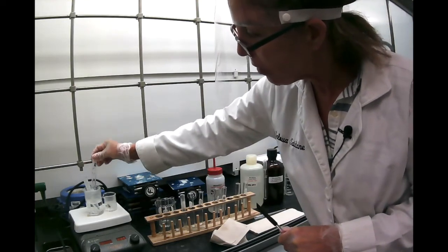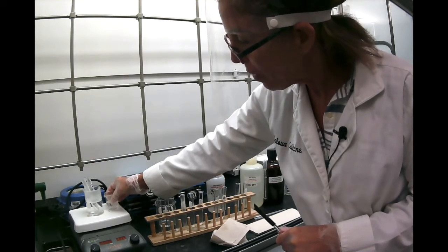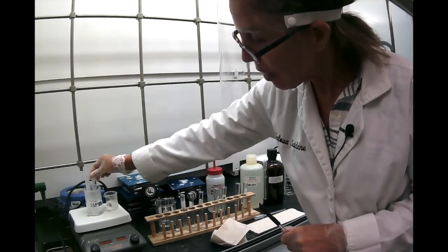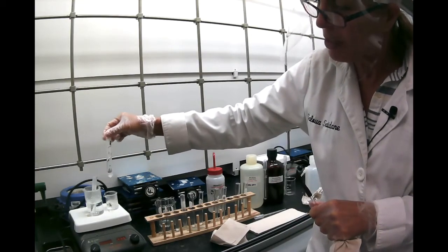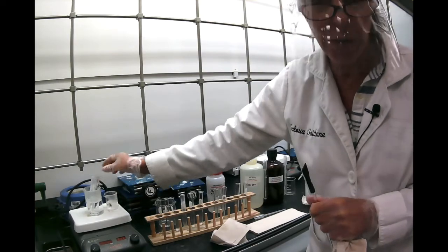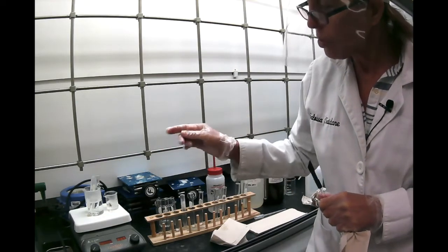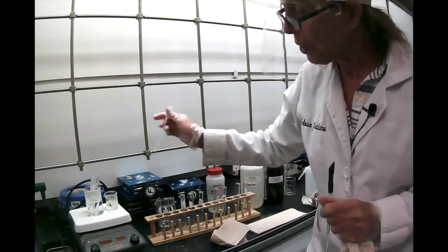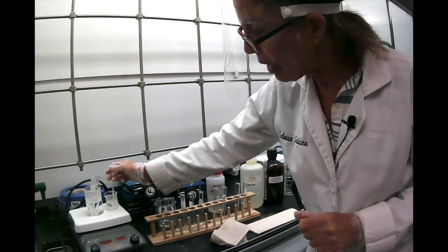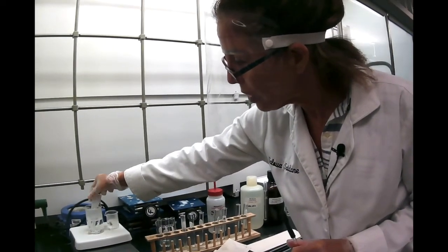Benzoic acid, though, I feel like we need to add a little bit more hot water. If benzoic acid doesn't dissolve, by the way, it means you probably didn't have enough water, so you really need to reach that saturation level. You don't just give up and say, okay, it's not soluble. Add a little bit more and see if it dissolves. And make sure, of course, your solution is hot.